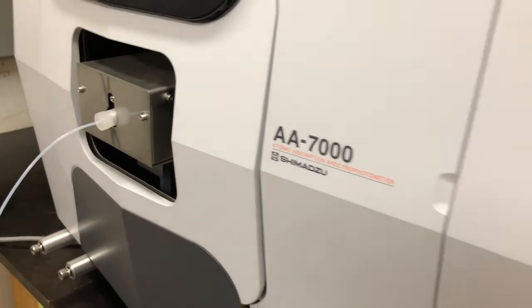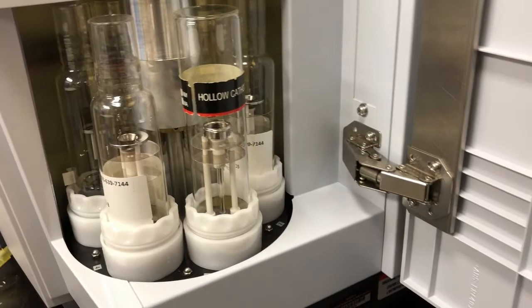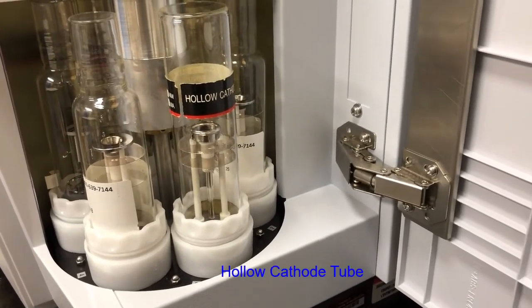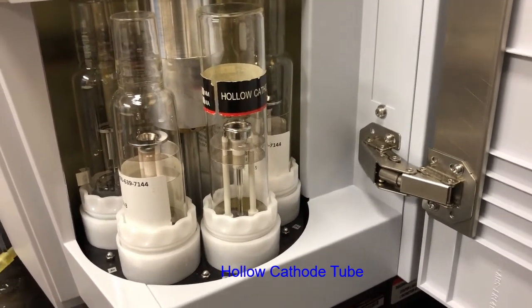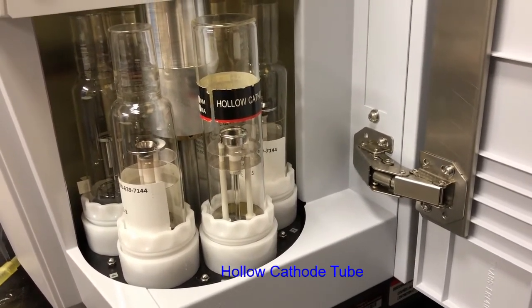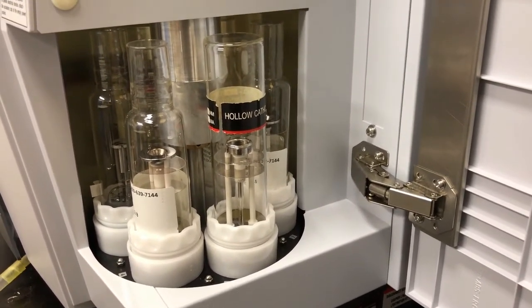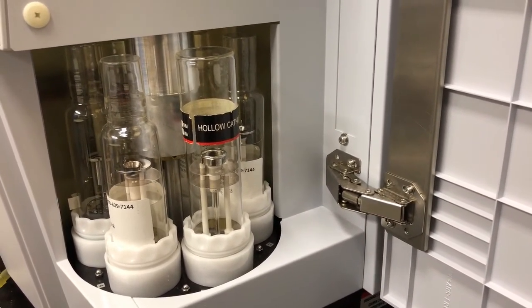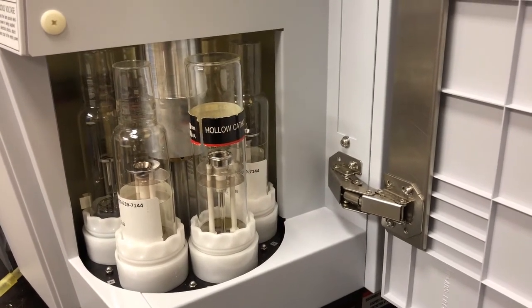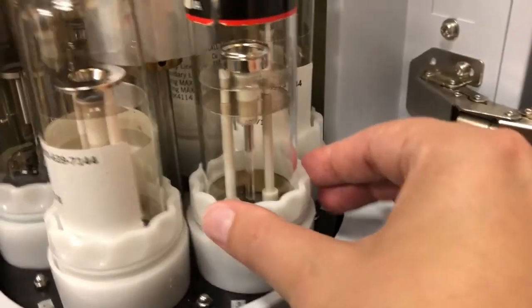Okay? So we have lamps in this unit. Come over here on this side, there's a little door, and that's where our hollow cathode tubes are. We have these lamps for every element that we're going to test. So if we're testing iron, for example, we would have a hollow cathode tube lamp specific for iron. These hollow cathode tubes contain the element that we're interested in, and it emits radiation at the same wavelength as the light of the element that we're interested in. So we have these specific for each element that we're looking for.